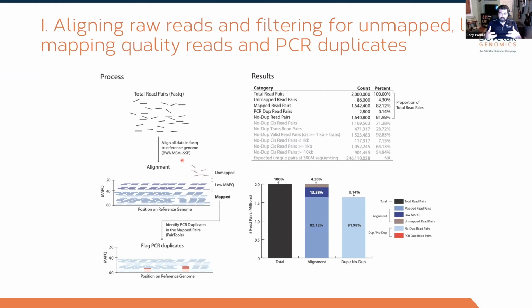So it's a paired-end alignment that's done in a single-end fashion. And this is actually the recommended aligner for any Hi-C data, restriction enzyme or not. BWA-MEM with this -5SP flag is the standard for dealing with proximity ligation data. All right, so now we have the alignment, and there are really 3 categories that you could be in.